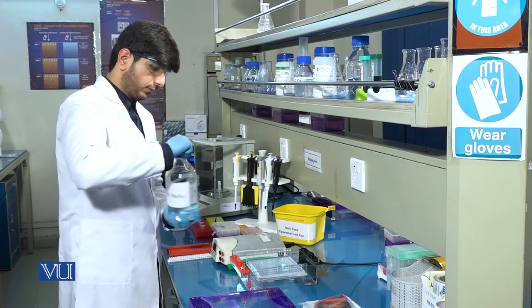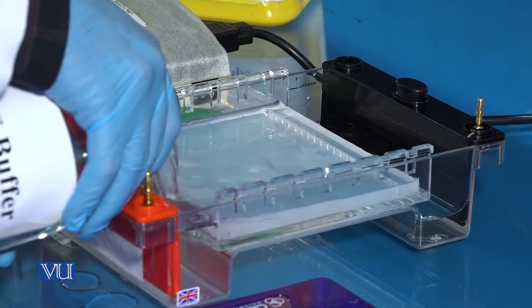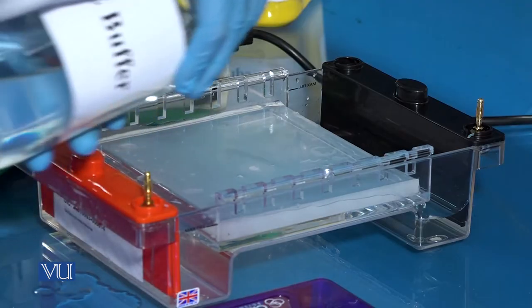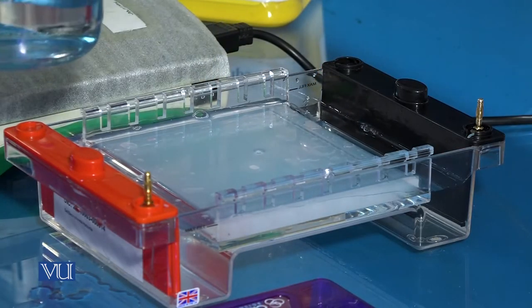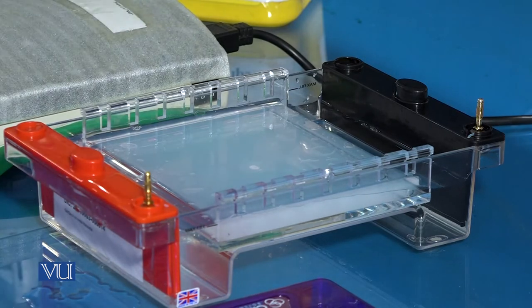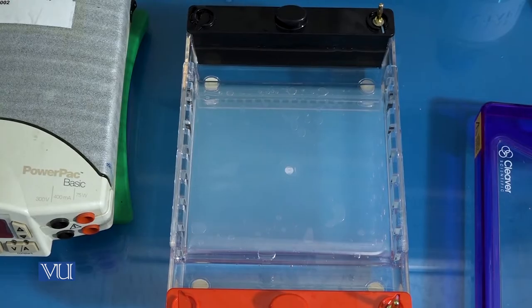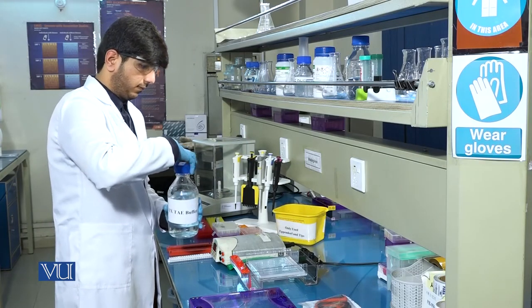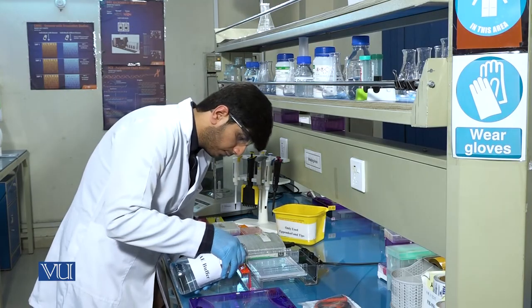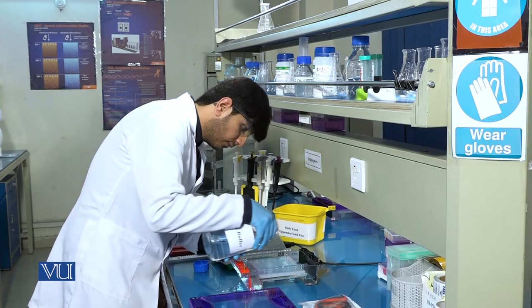Add 1X TAE buffer into the gel tank. It should be noted that the same buffer will be added into the gel tank that was used for the gel preparation. Add the buffer to the level that the gel is completely submerged inside the buffer.